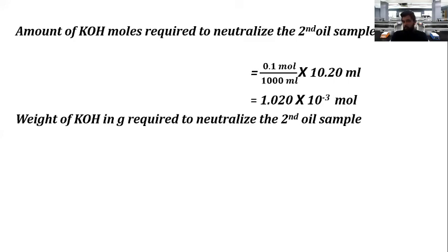In here, we don't consider the first reading because it is not in good match with the other readings. But if it is in good match with the other readings, it's okay to use it.